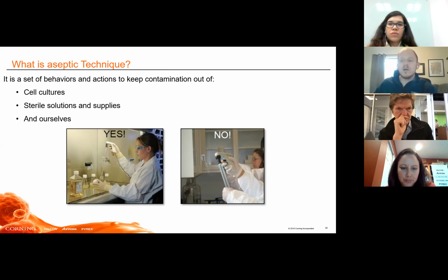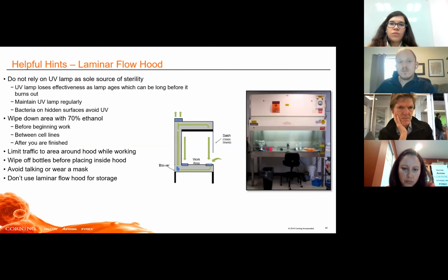It's thinking about, when I pick this up, am I going to be touching this sterile material with something that's non-sterile? One obvious thing is these pictures right here. You have somebody grabbing the stripette with their hand, which is unlikely to be sterile, right? So it's a group of practices and a mindset of when to touch things and where to place things to maintain the sterility of your cell cultures and your reagents.